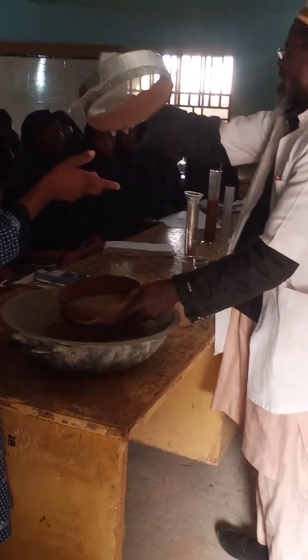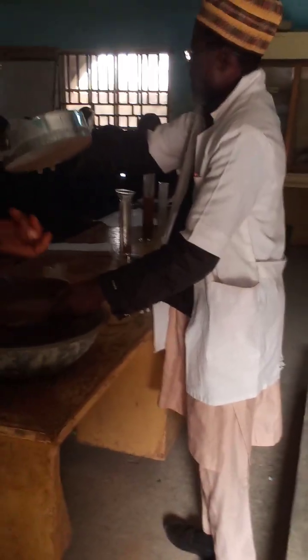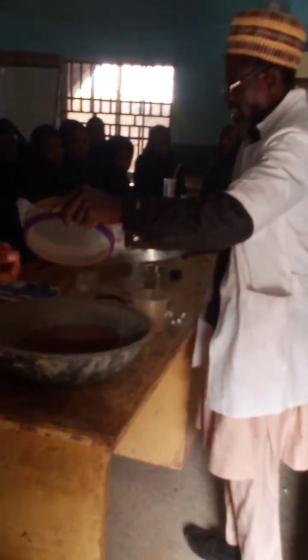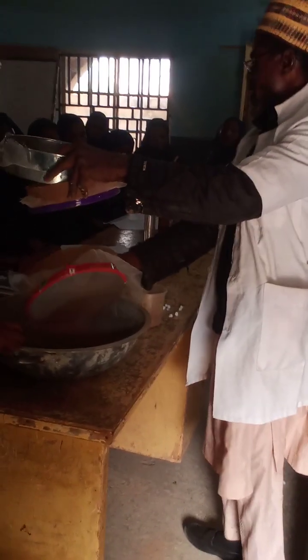So they are in the first sieve because they are very large in size. Look at it. And you look at the second sieve, there are also some particles there that cannot pass through the sieve. You can see. Then you go to the third one. There are also some particles there that cannot pass through. You can see them.